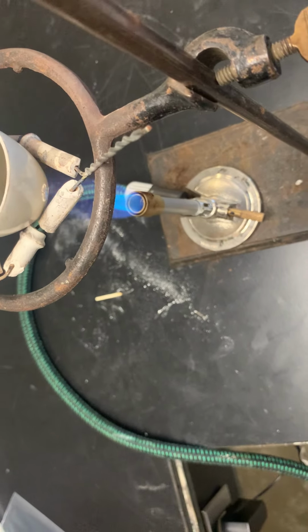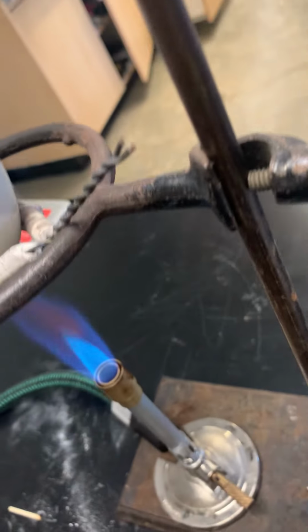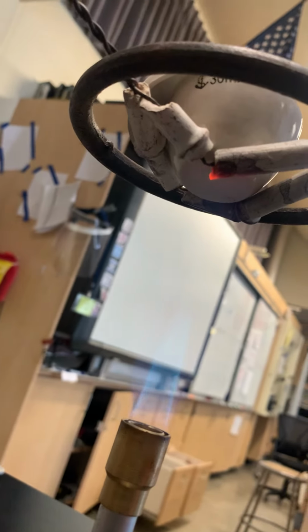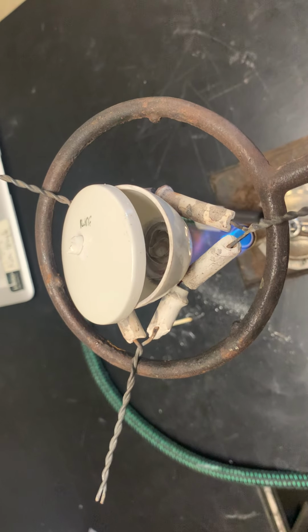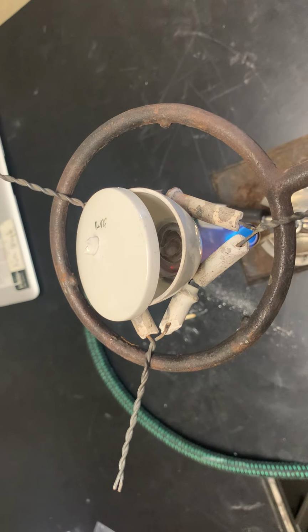And now we can see a little bit of orange flame going around. What we would like to see is, well, there's a little bit. We want the ceramic to start glowing. So we've got a little bit. Need the reaction vessel to glow a little bit for this reaction to take place. Let's find a nice view. There we go. Oh, sparks. Sparks means the reaction will happen.